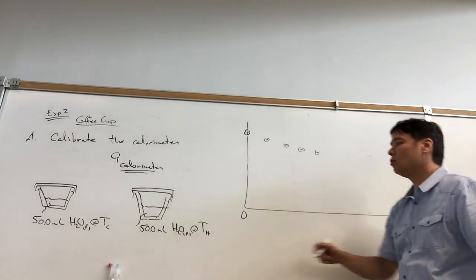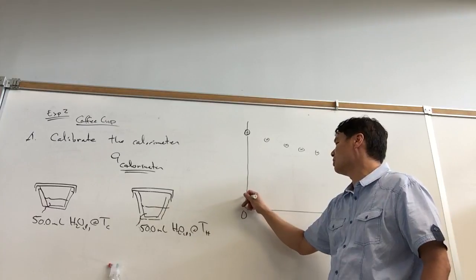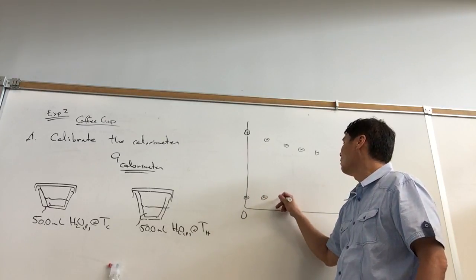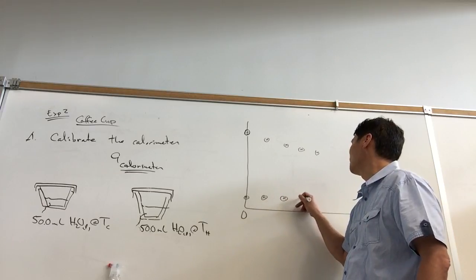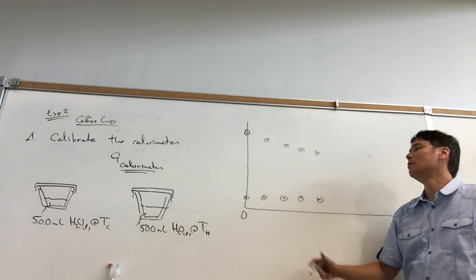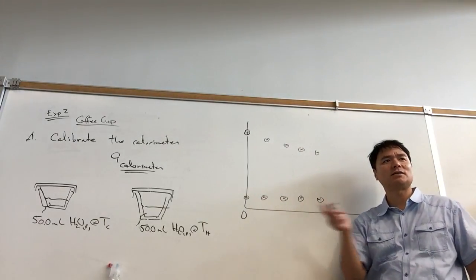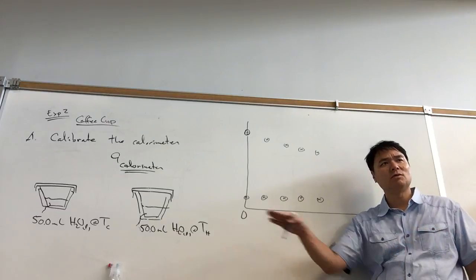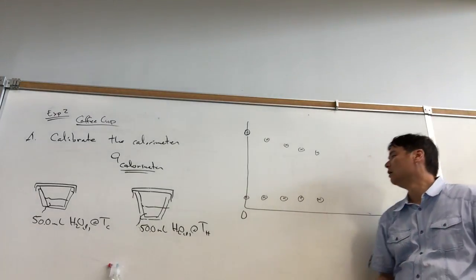Now the cold water is very close to room temperature. It might warm up a little bit because out of the tap it might be a little cooler, or it might not. Maybe it's at room temperature out of the tap. And so we don't expect much to happen with the cold water, but we'll still monitor it just in case it comes out of the tap colder than the room. It'll warm up a little bit, right?